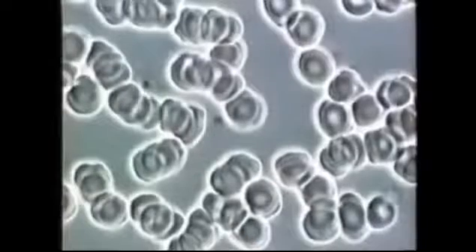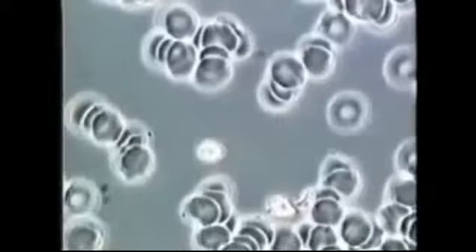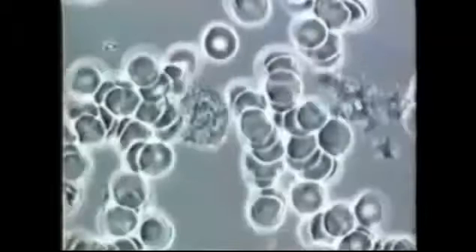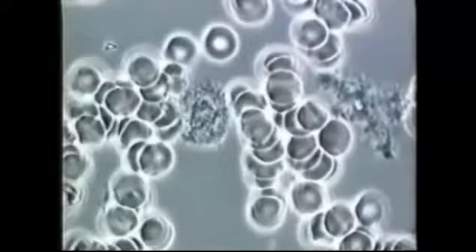Now, this is Terry's blood. Her red blood cells are hooked together in chains. This is called rouleau. As such, the transportation of oxygen is drastically hindered. This results in a decrease of circulation, which can cause chronic fatigue, poor digestion, and edema. This clumping of cells cannot penetrate Terry's capillaries, which can cause degenerative tissue diseases. The needles in the areas between the cells are liver stress marks.